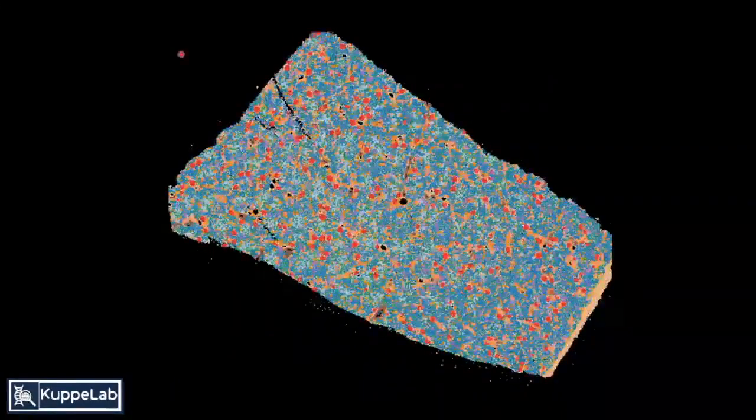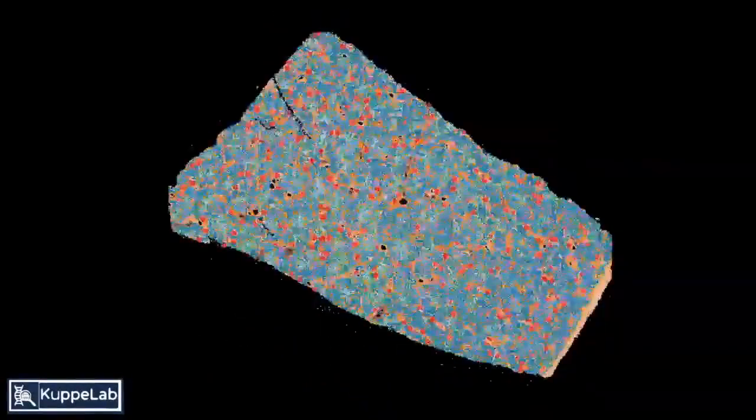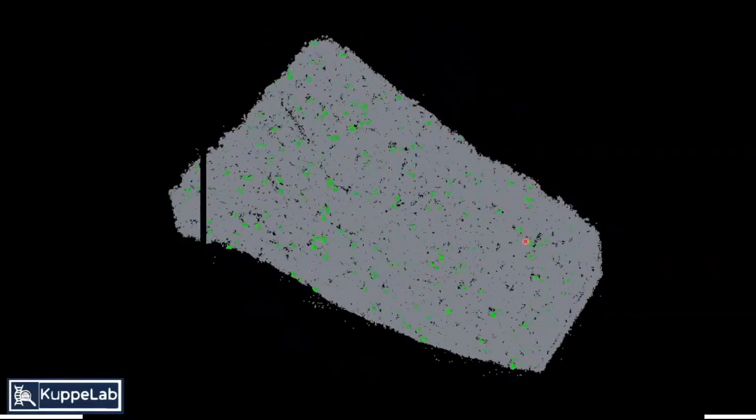But what we would like actually is this sort of situation where we have the single-cell information of each individual cell and its cell state and can map it back into the tissue. And this is here a human kidney tissue section where we've just, with some marker genes, highlighted the capability of this technology to really map out all of those cell states in one tissue. And here's another example. These are podocytes. So these are the cells of the filtering unit, and you can clearly see how nicely these cells actually map to the tissue, allowing you now in the data to compare the expression profile for any given glomerulus to another in the tissue.